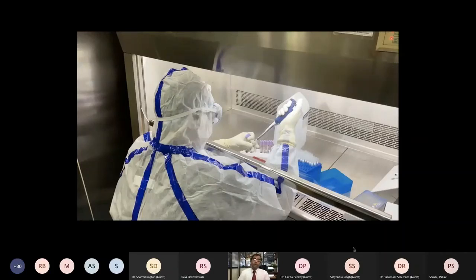Whereas if you are doing discovery work or global proteomics work, you have to rely on the depletion, because if you run your sample which is a mixture of high abundant and low abundant proteins in global proteomics, the high abundant proteins are going to mask the low abundant proteins. So in the mass spec, when you analyze all the peptides in their ionized forms, all the abundant proteins will take over and you will only see hits for albumin and IgGs, and sometimes your friend keratin will come.